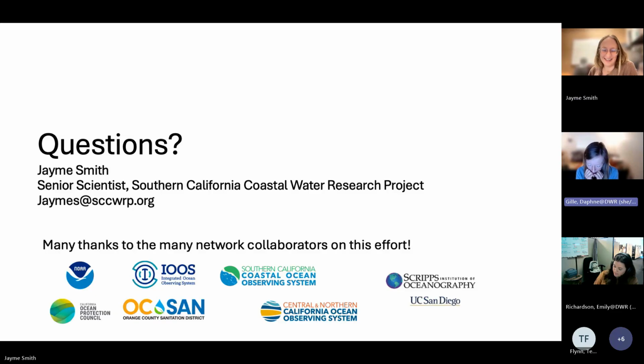Thanks. I was wondering, as we think about using an IFCB in a more freshwater system, the idea of creating references and getting all of these images, we don't have a network really to draw from. If we were to do it, we'd be kind of the first movers. I'm a little worried about how much work that would entail, and if there are any existing resources that we could draw from, or if it would be us standing it up by ourselves. I'm sure there's some overlap with some of the marine sources, but I'm just wondering if you have a thought on that.